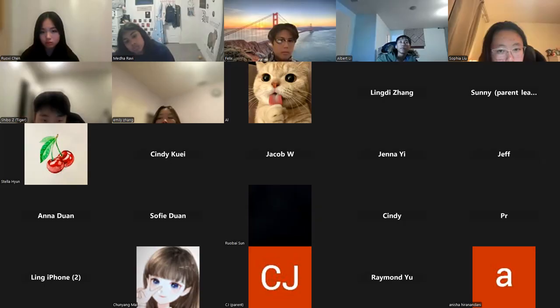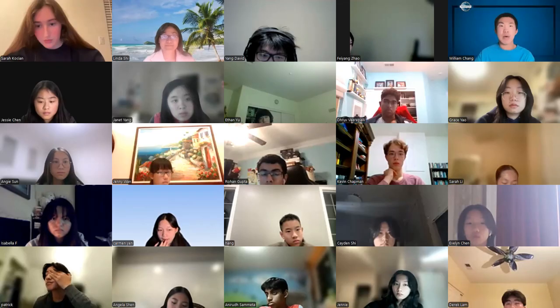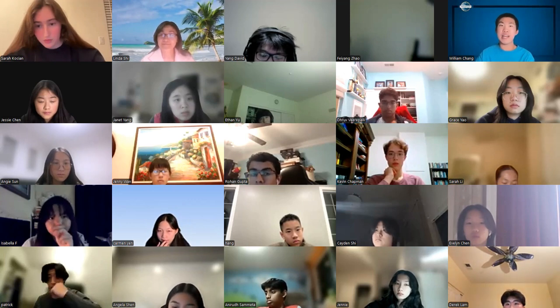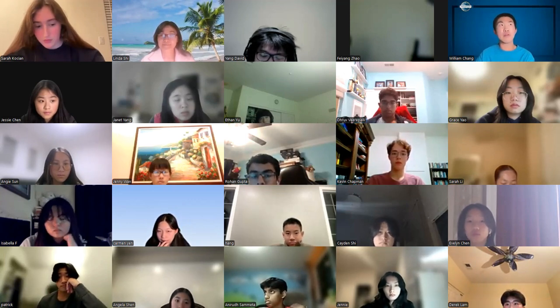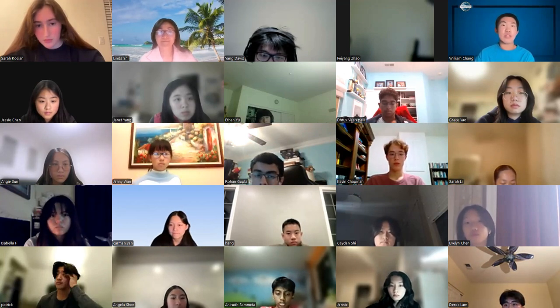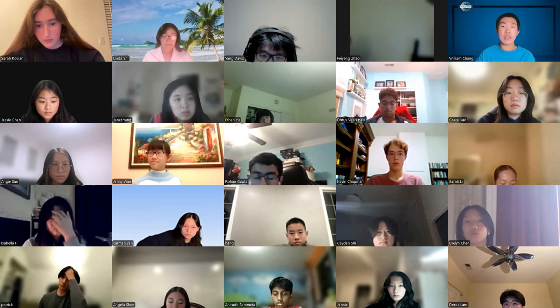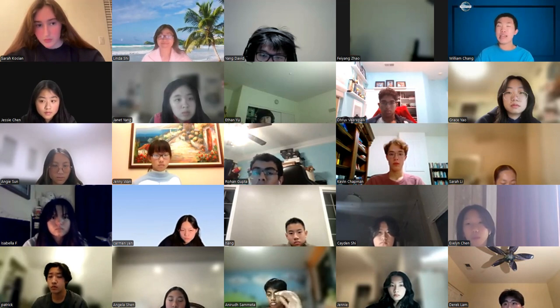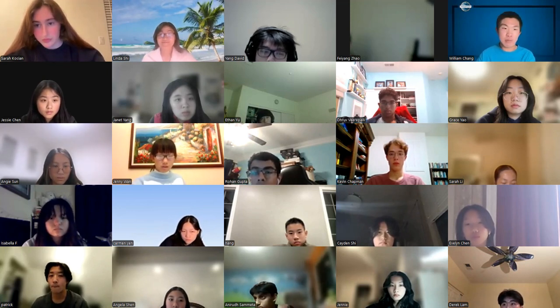I will say that for Python Cellpose, you also won't necessarily get to use it. My project didn't use Python Cellpose, but we were experimenting with it at one point. This is also not something that you, quote unquote, have to do, but we highly encourage that you have some exposure to all of these different platforms.